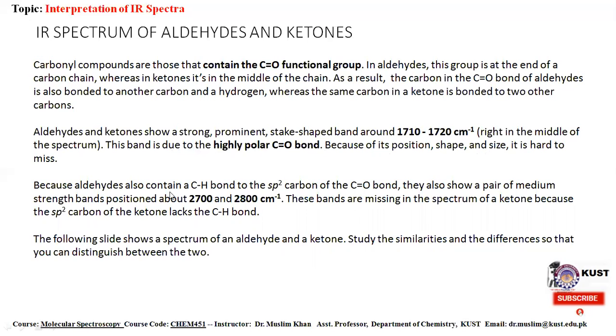Because aldehydes also contain a carbon-hydrogen bond to the sp2 carbon of the carbon-oxygen double bond, they also show a pair of medium strength bands positioned between 2700 and 2800. These bands are missing in the spectrum of ketone.